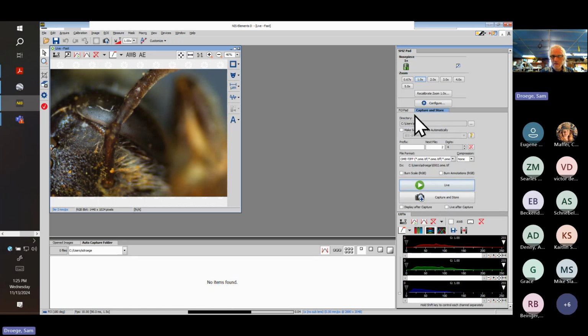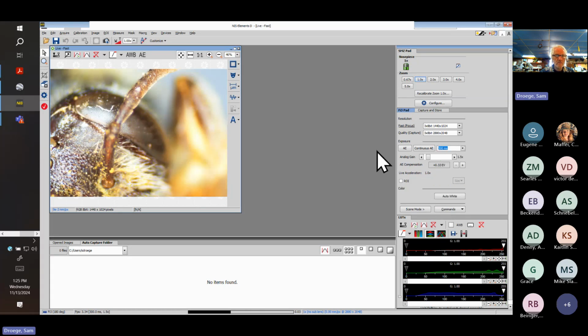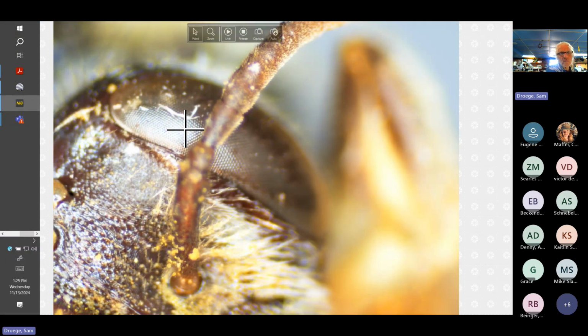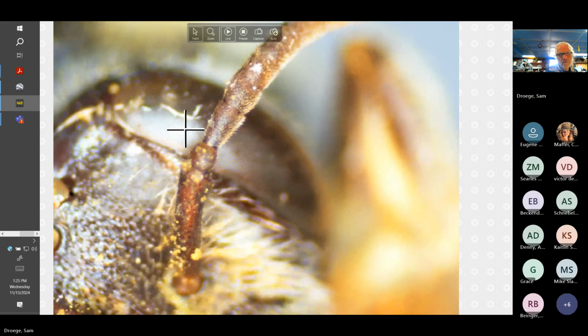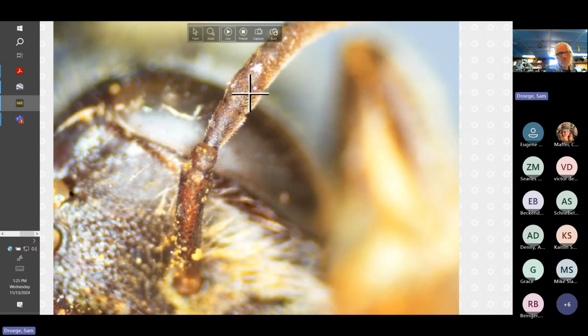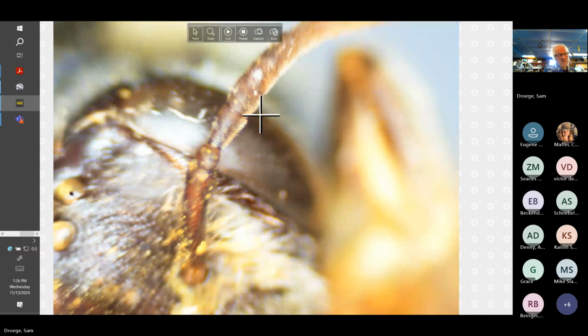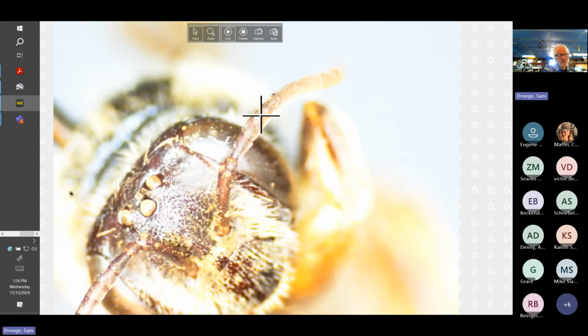Here's the lower boundary, here's the upper boundary. This would be the length, and this would be, I believe there are measurement guidelines, the maximum width. So it is a bit longer, but not outrageously off of a one-to-one configuration in that view.